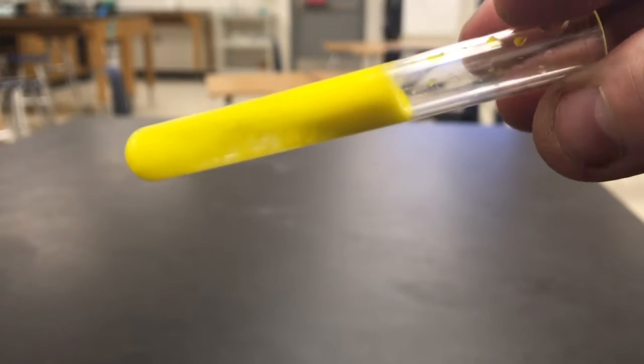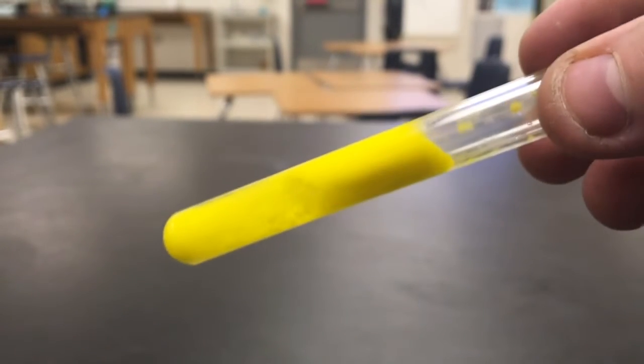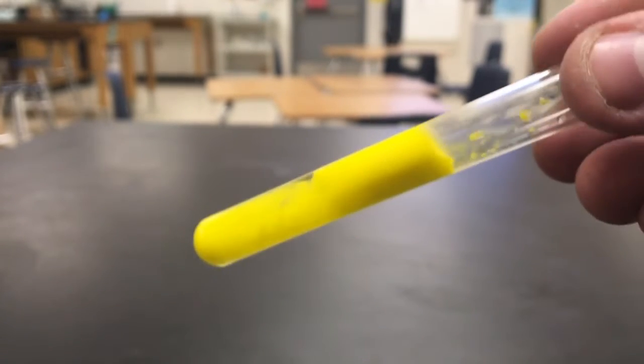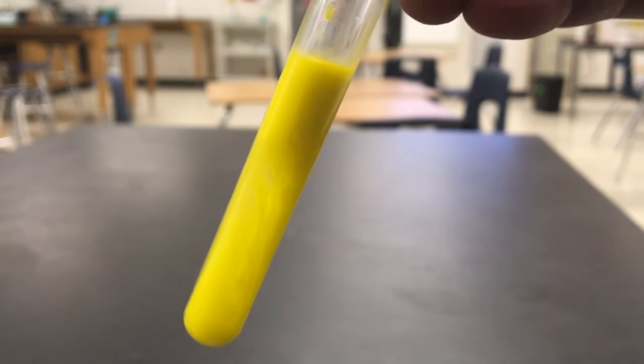So it is still kind of liquidy. You can see it's not actually a solid frozen chunk like ice is, but we have definitely had a chemical reaction happen here.